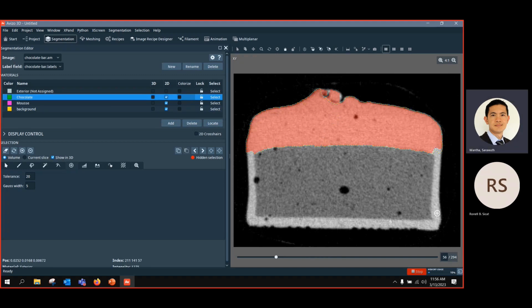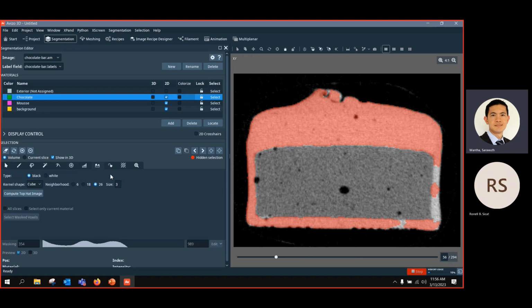So it's really manual, and maybe it's not working very well for some images, so you need to be careful about this. Okay, I hope this is clear with the blow tool. And okay, that's what we did. Now the very interesting part is watershed segmentation.